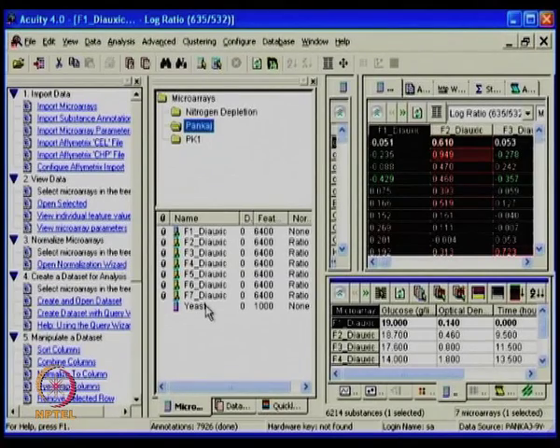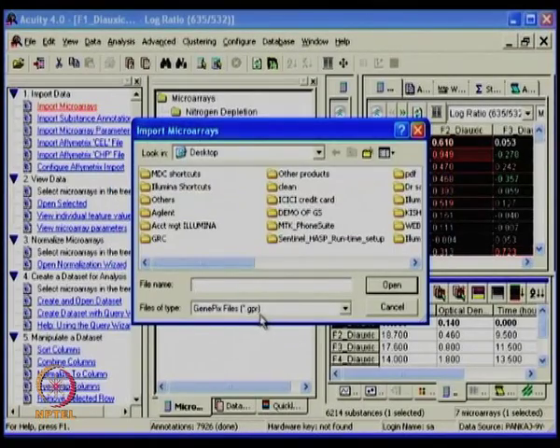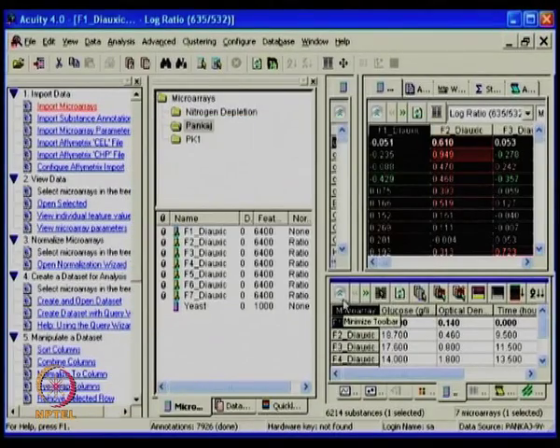So first you have to individually scan each of the images, make one folder where you group all of this, and then use that whole data set for the combined analysis. Right. So you can have all the GPR files stored, or one by one from GenePix Pro, and just import the data in the form of import microarray data file. So it just goes on looking for the GPR file, and this can now be imported and ready for your analysis. Once the data is in, this will be displayed down in the form of the folder which you have kept for the analysis.